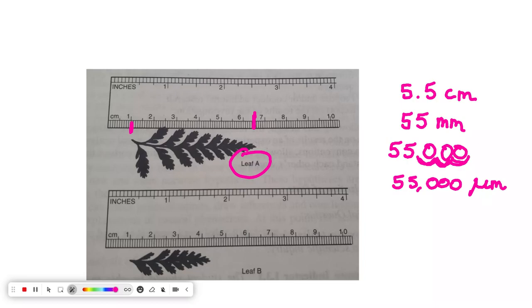But you won't use micrometers. You're only going to use micrometers under the microscope. So it's important, though, if you see this, to find the length of the leaf. They might ask you for it in millimeters, and you can do that.